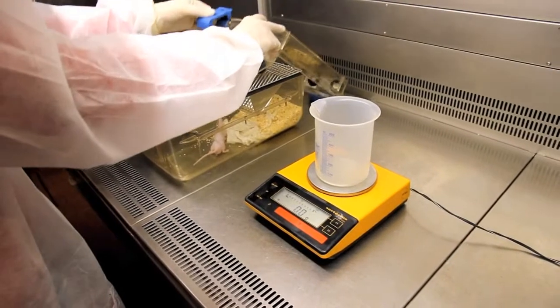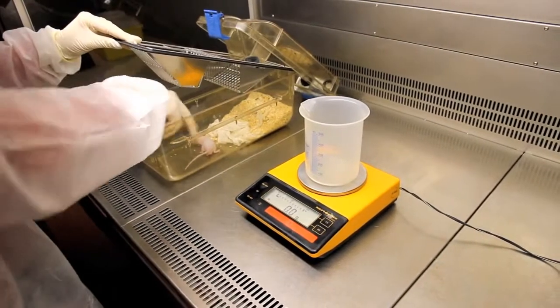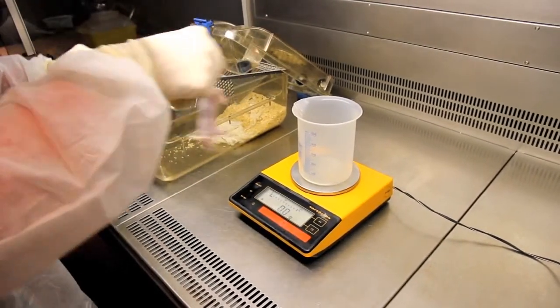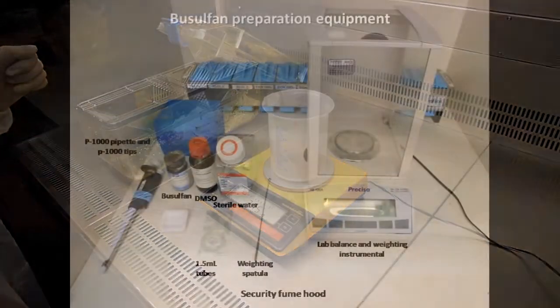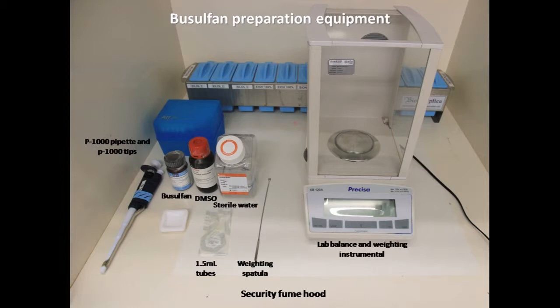Remember to work always in sterile conditions. Once we know the weight of the animals, we can proceed to preparing the busulfan to be injected. Here you can see the materials for this purpose. Due to the high toxicity of busulfan, which is an alkylating agent, remember always to work in a biosafety cabinet or fume hood using gloves, lab coat, and mask for your own security.